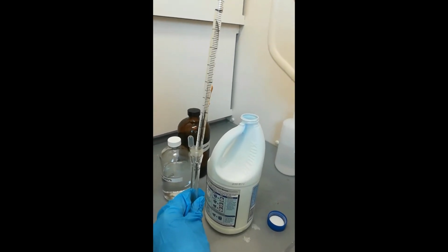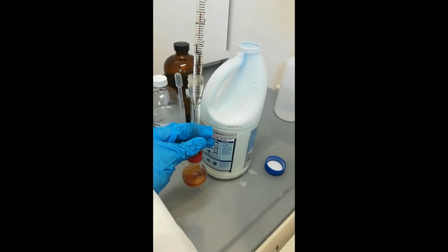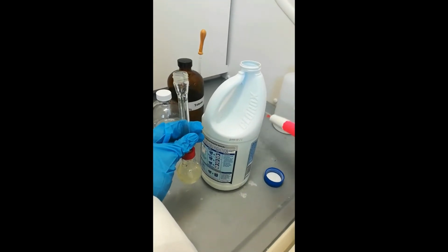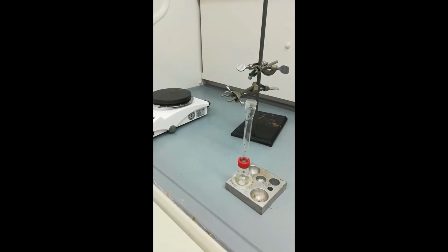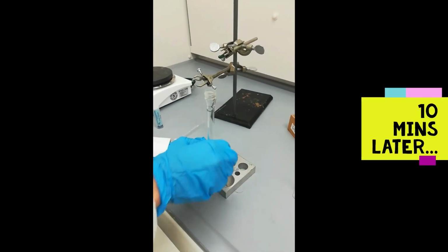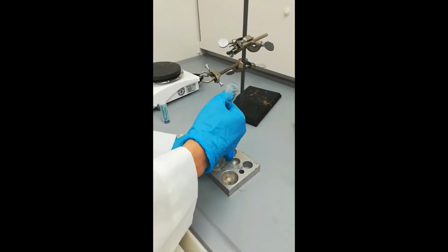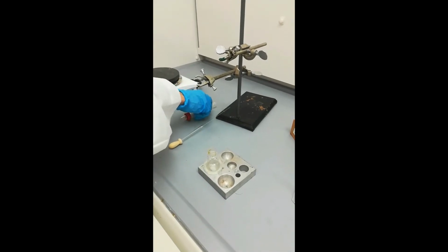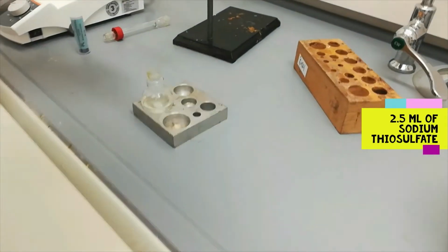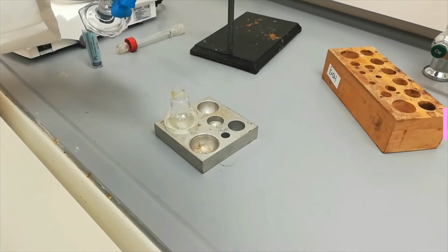While quickly adding the Clorox bleach to the round bottom flask, notice the color change. The flask was quickly swirled after the addition of bleach. Then leave the reaction mixture in the round bottom flask on the benchtop for 10 minutes. After resting for 10 minutes, carefully dismantle the condenser, and then add 2.5 ml of 10% sodium thiosulfate.